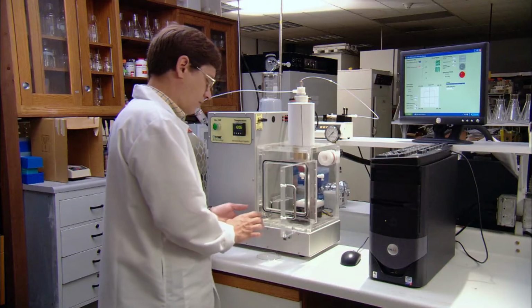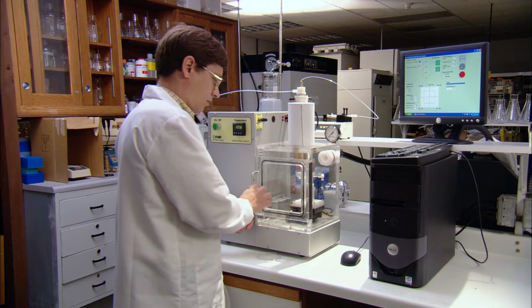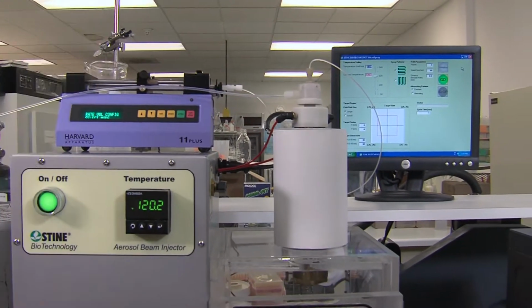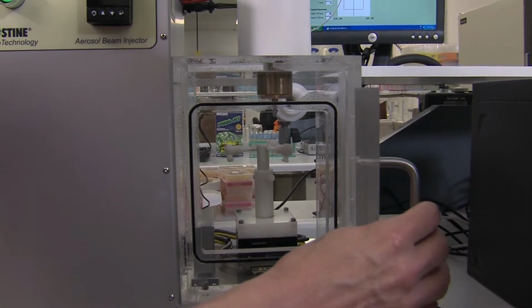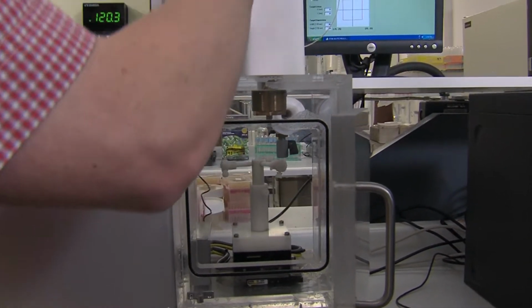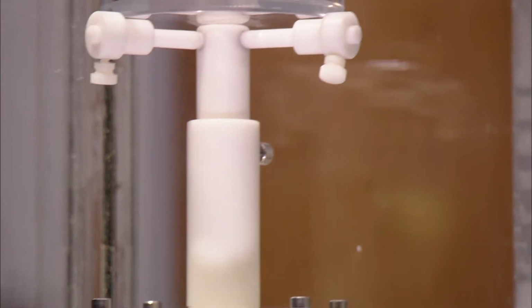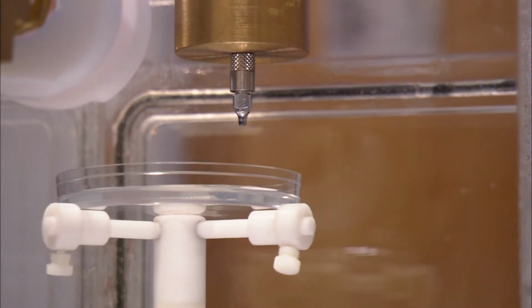Sure. This is our proprietary device, and it works by first having a DNA solution metered into the top of the device, and here we create an aerosol, and then in this bottom chamber we'll put the plant tissue, which will be transformed, and we'll pull a vacuum in this bottom chamber. This vacuum will pull the droplets down through this small orifice, and when they enter that orifice, they're accelerated to supersonic speeds. Wow. And that's what gets the DNA into the cell. So you just shoot a stream of DNA right into the plant tissue. Exactly.